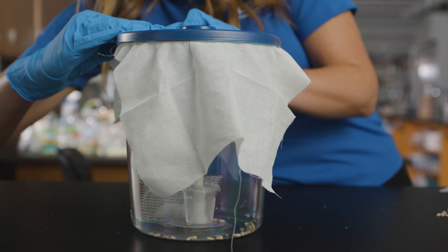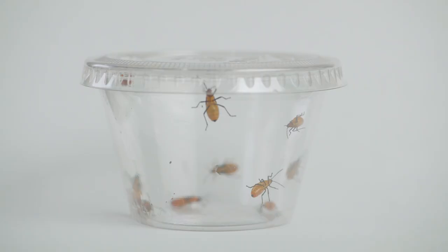The culture can be maintained at room temperature out of direct sunlight. Insects in the order Hemiptera emerge from their eggs as smaller versions of adults, called nymphs.